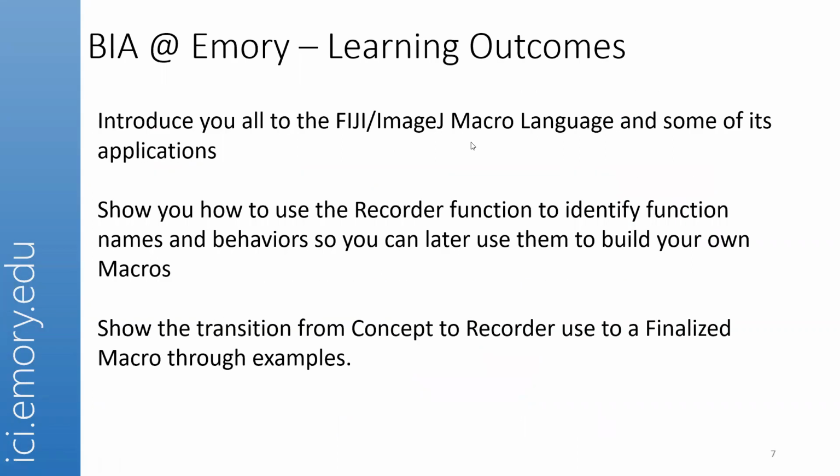So what is today's session about? What are we trying to learn today? Well, I want to introduce you all to the macro language available in Fiji. I want to show you how to use that capability to let you analyze data more quickly and more reliably using these functions.